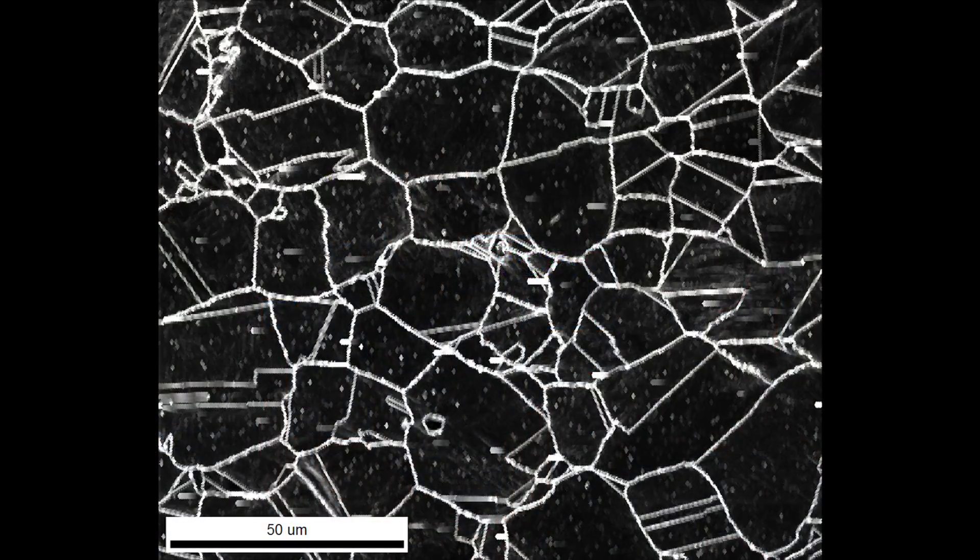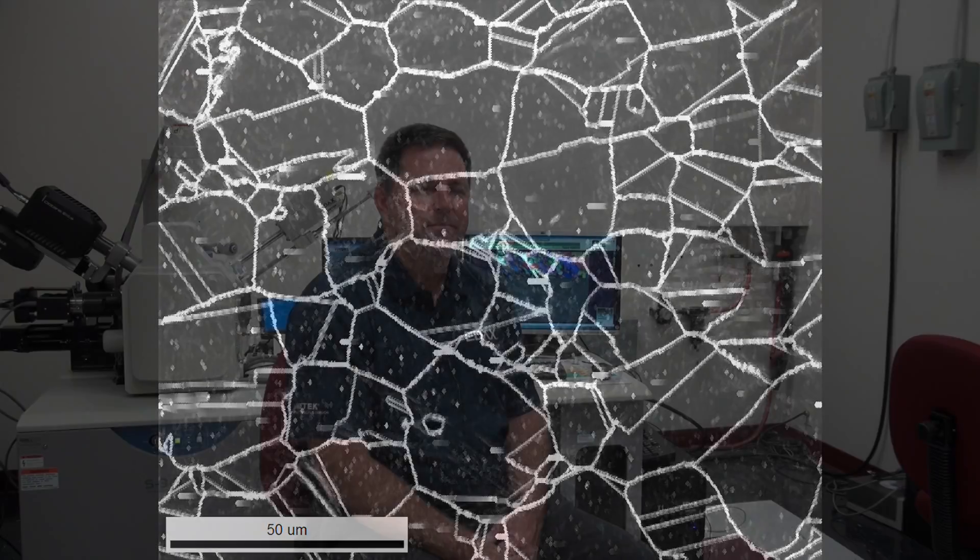PRIUS Imaging can also be used to identify the position of grain boundaries within a material. This information can guide the smart acquisition of EBSD data by only collecting one measurement per defined grain.